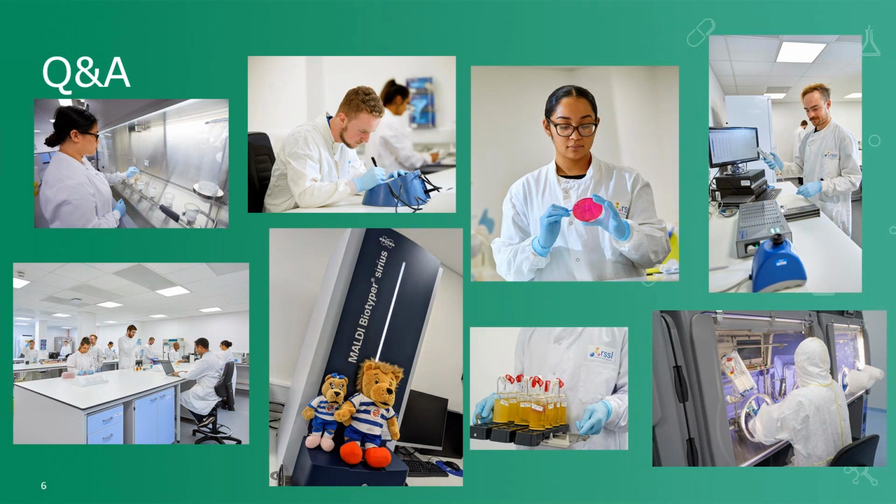I think in grade D, you will occasionally get some levels of fungi. I think as part of your biocontamination control strategy, what you want to be seeing is none of those same organisms detected in grade C, and certainly nothing going further into any aseptic facility. You also need to obviously ensure that none of that's ending up in intermediate product or whatever the process is going on within that grade D room.